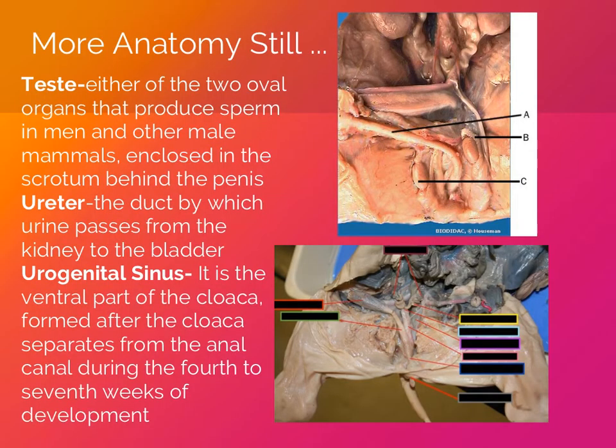Analogous to the female's reproductive structure, the testes is much like the ovary in that it produces the male gametes. It produces sperm, whereas the ovaries produce the eggs. It also kind of looks like a little ovary. In this picture, you can see the epididymis. Letter B is the epididymis, so that surrounds it. The vas deferens is kind of like the fallopian tubes. The fallopian tubes carry eggs, and the vas deferens carry the sperm, so they're analogous structures.